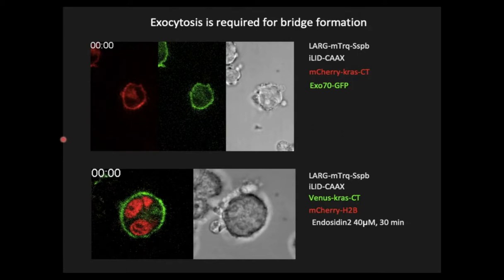In the second movie, I will also show how we can combine the optical control and use inhibitors, small molecules, and see the effect in real time.